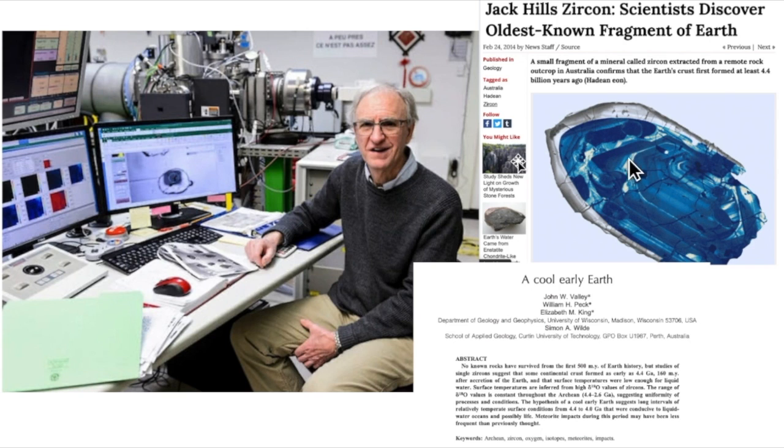So as you can see, this is a very zoned zircon, so each layer has a different age, and because of the small sample size of the SIMS, they were able to measure the very inner core, which resulted in an age of 4.4 billion years old. So this indeed is the oldest known fragment of Earth.